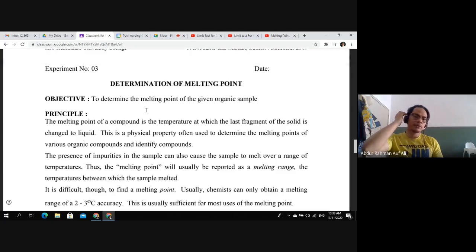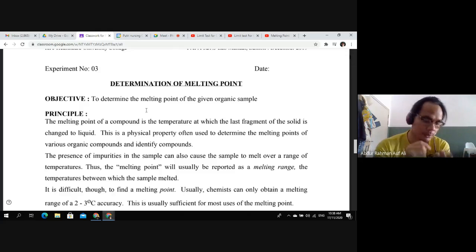Determination of melting point. So selalunya test untuk melting point ni, the purpose is we do it to identify the sample. Selalunya when I was working at a lab dulu, the production department after dia dah proses, dia dah buat ubat tu, dah jadi sebiji tablet. Asalnya daripada raw materials, all the coating agent, bonding agent, dia campur, dia mix everything with the API, active pharmaceutical ingredient. Kemudian dia compress, dia pack dalam blister cantik-cantik, dia akan hantar kepada QC lab. That's where I work dulu.